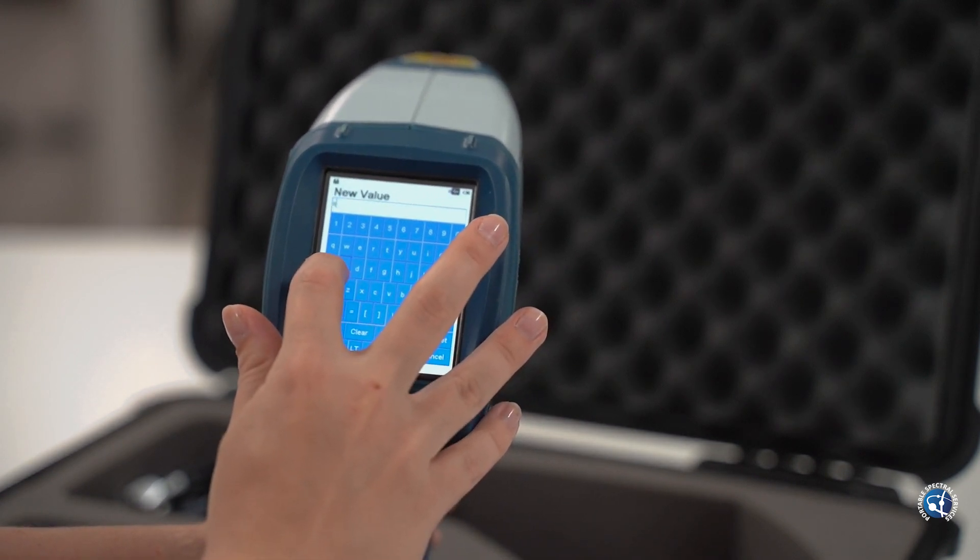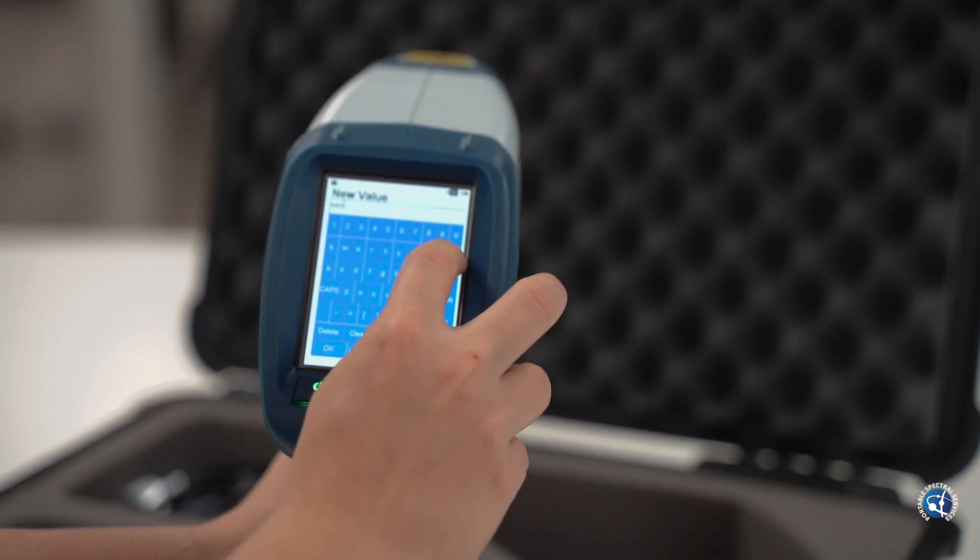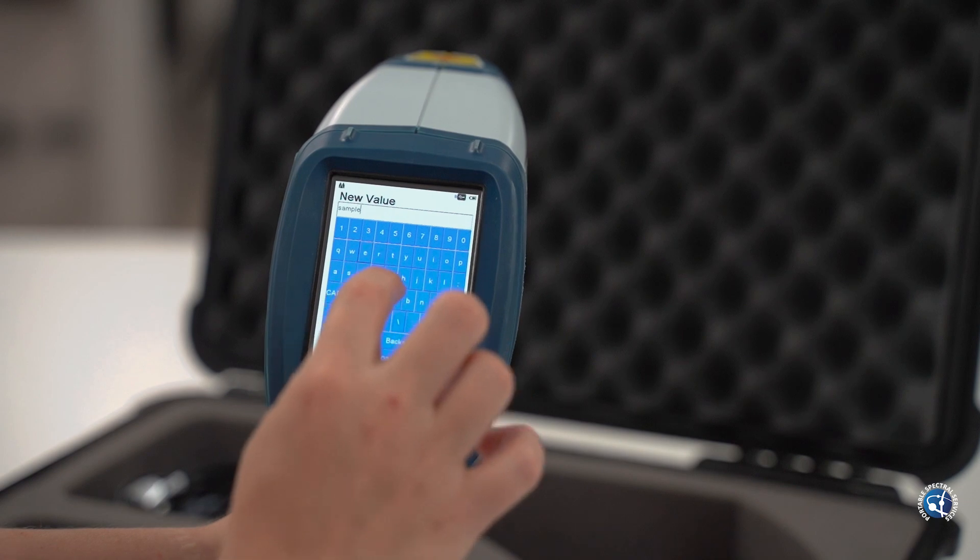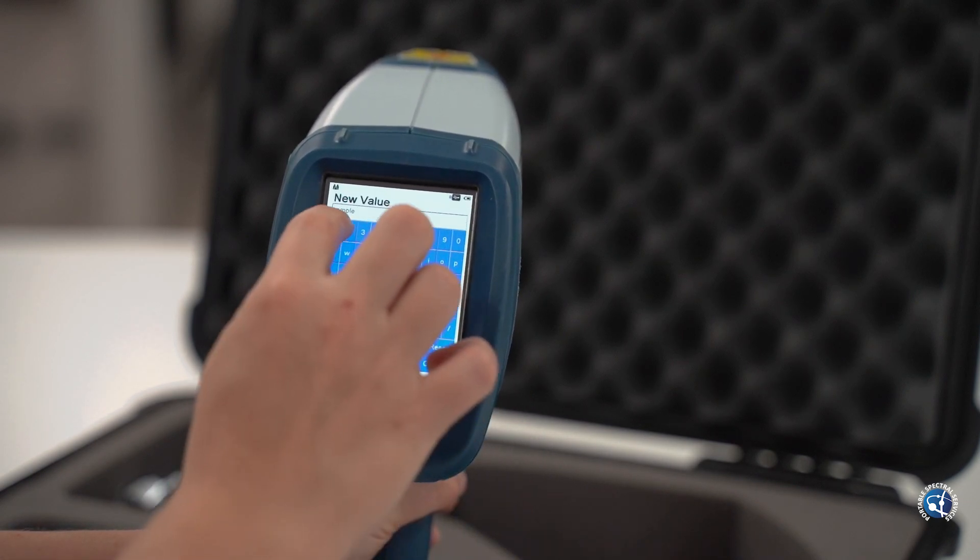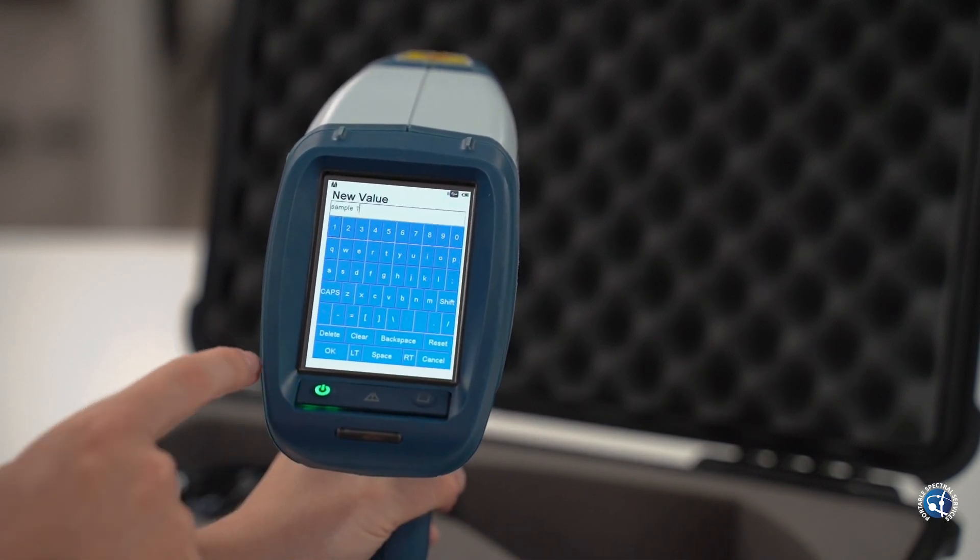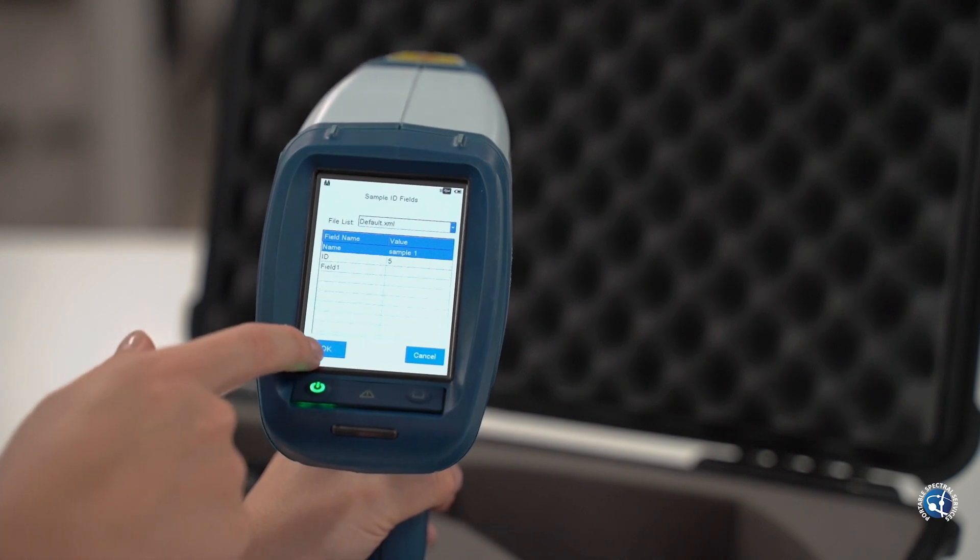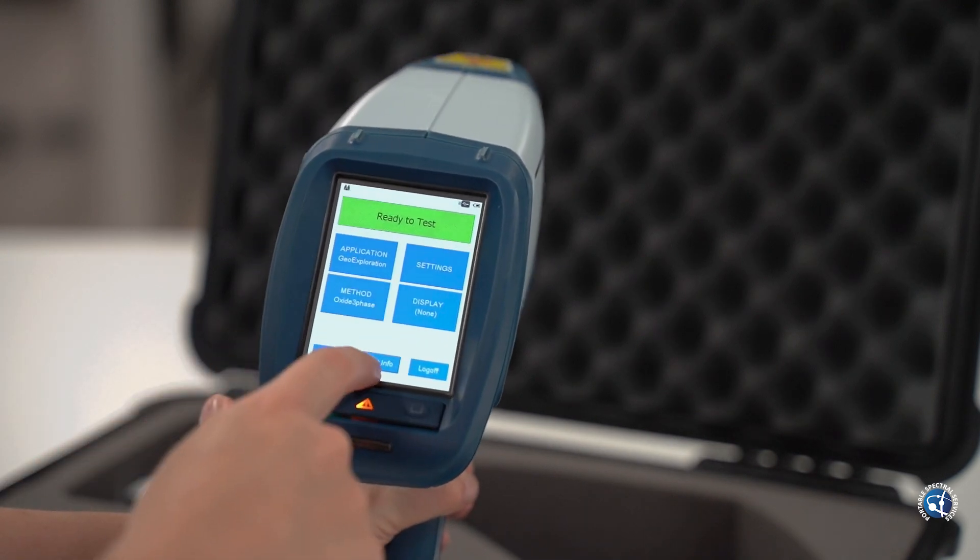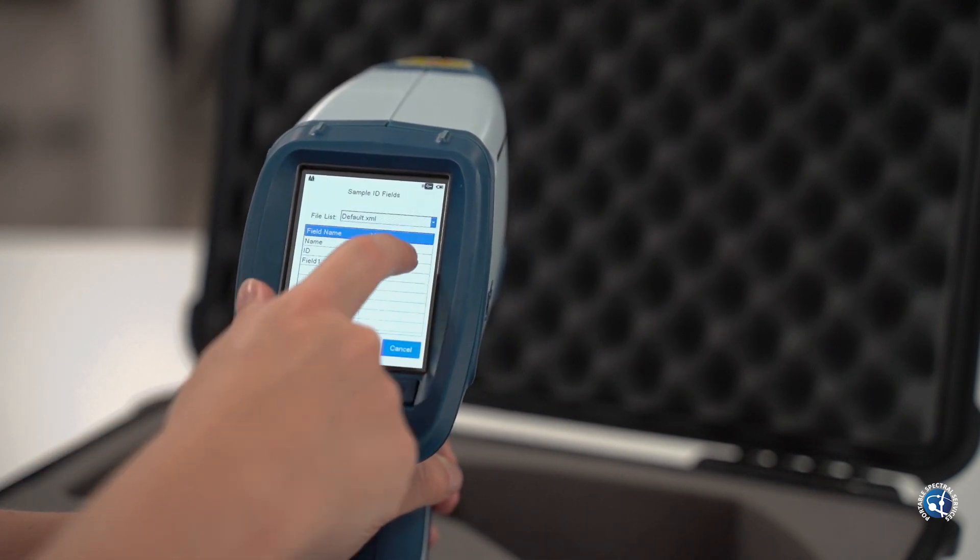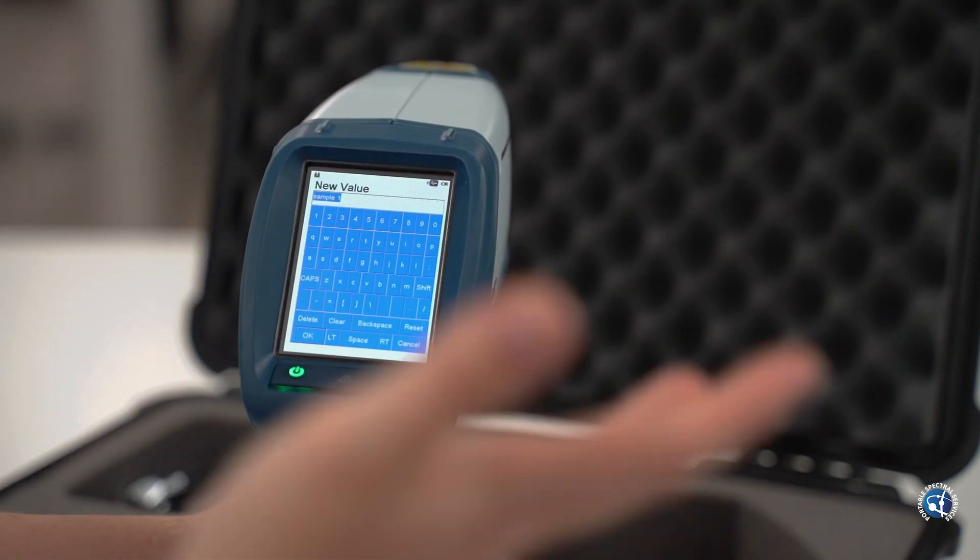If you want something a bit more customized you can do so by clicking edit info, configure and here you can add new rows and create more customized sample identification for your project, such as countering where you can auto-increment sample IDs so you don't have to change the name manually every single analysis.